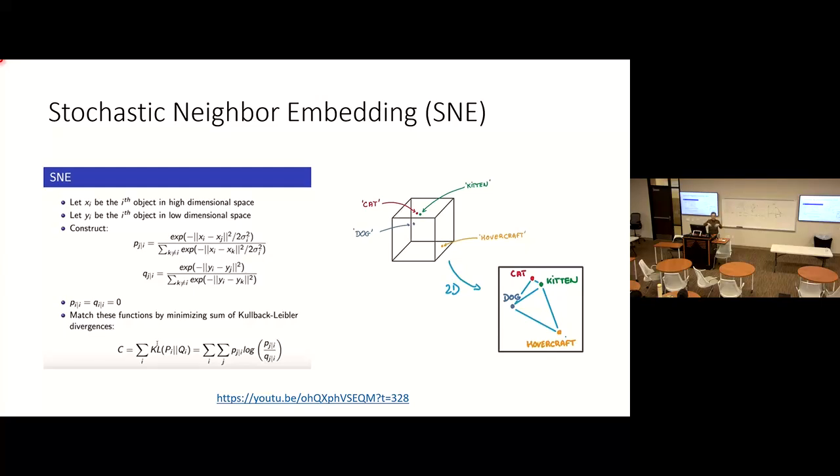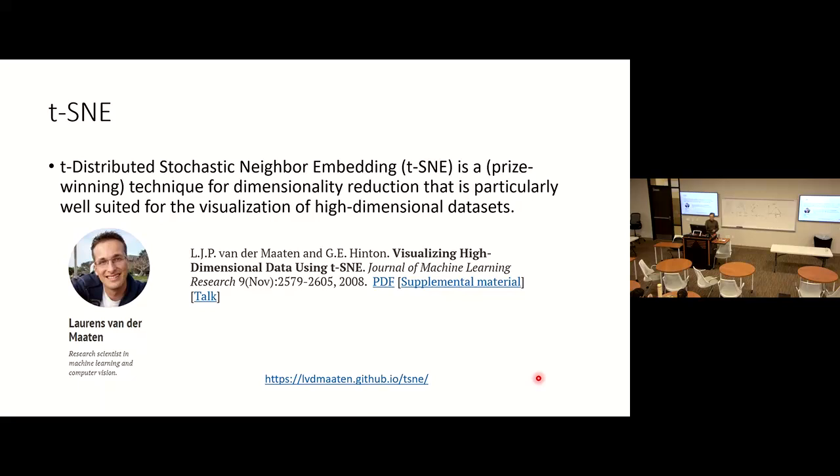So if I run t-SNE again using a different random number seed, I will generate a very different picture, but the relationship should be kept. So the cat or kitten may not be in that corner of the 2D, maybe at the bottom of this picture, but the relationship with others should stay the same.